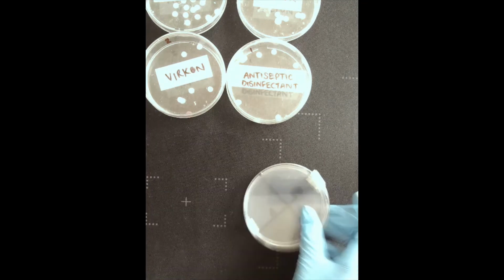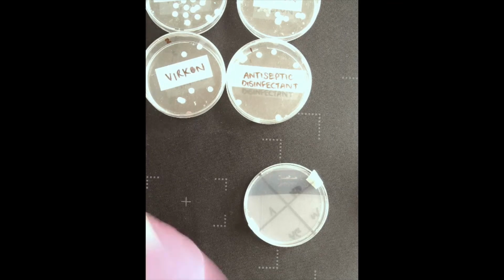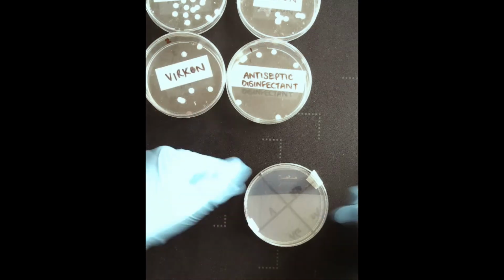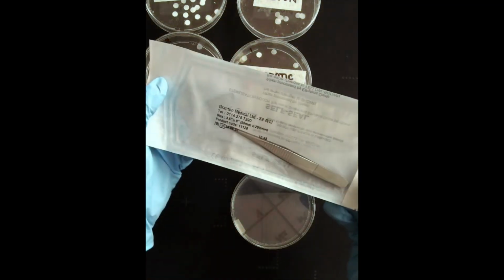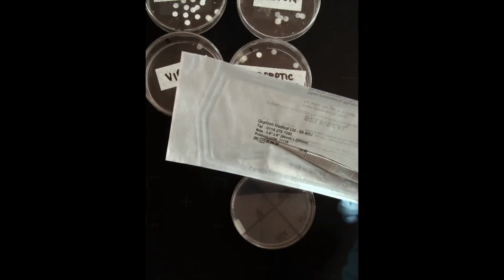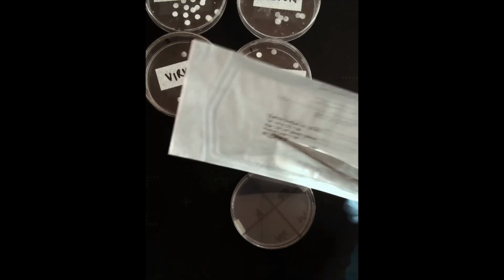I'm just going to pop the lid on. Now, in order to transfer each paper disc onto this Petri dish, I'm going to use a different set of tweezers which are in this sterilized pack. So I've got 4 different sets of tweezers. It's important to use different tweezers so I don't cause cross-contamination between the results.